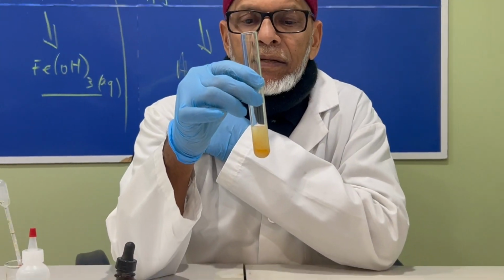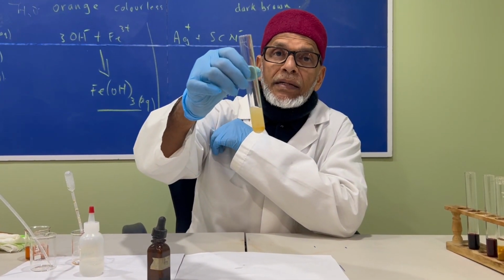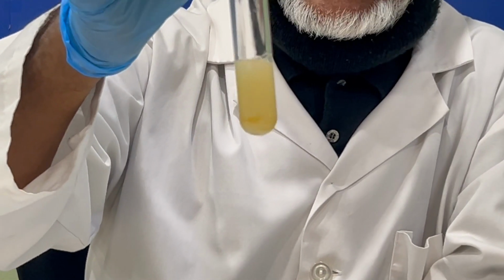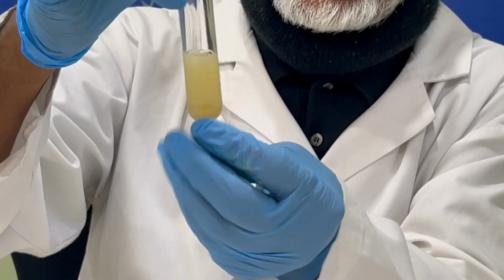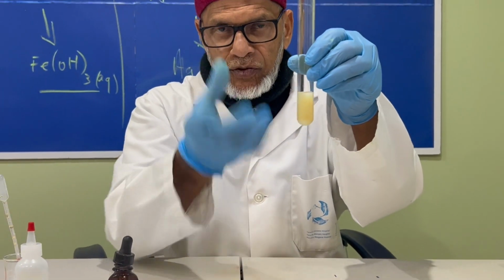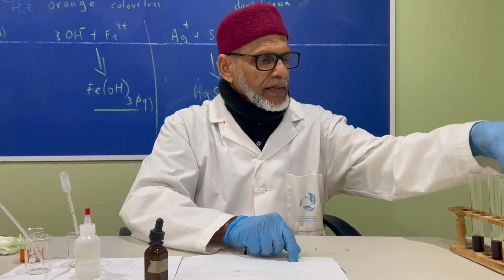You can see there that the color of the solution became lighter, and if you look carefully, you can see that a white precipitate was formed there. Leave this for a few hours, you will see that the precipitate will be more visible at the bottom there due to the influence of gravity on those small particles there.